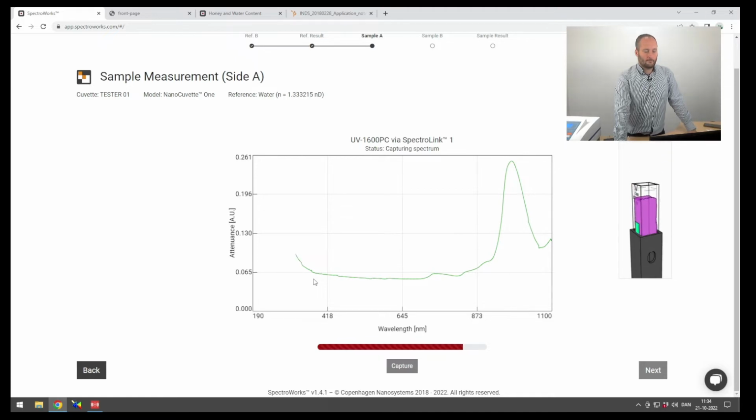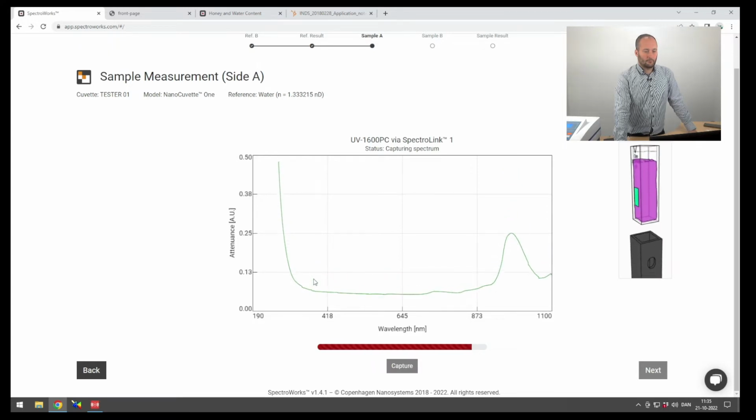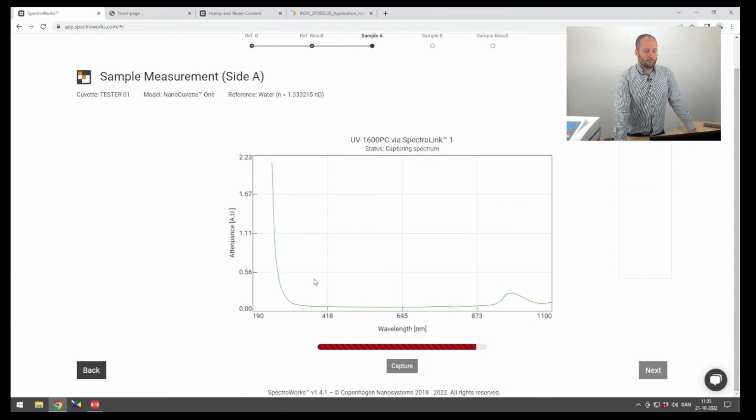So I think that there's no real problem with choosing one of our devices. Ocean Insight is not too keen to export the Red Tide. It's more a teaching device than a measurement device for production. Okay. So they would rather we take up the next level.